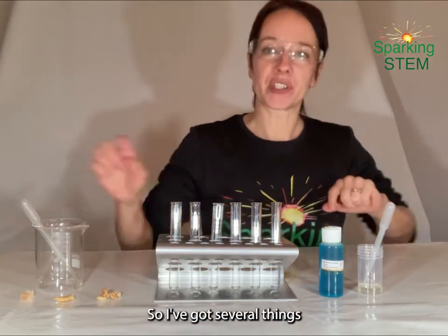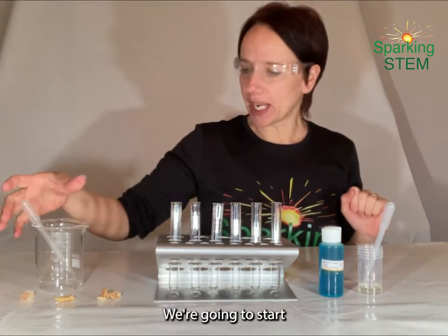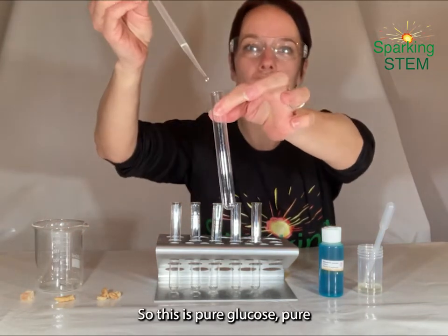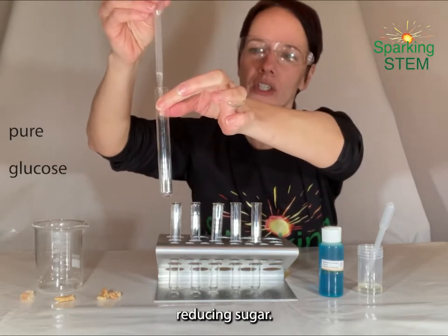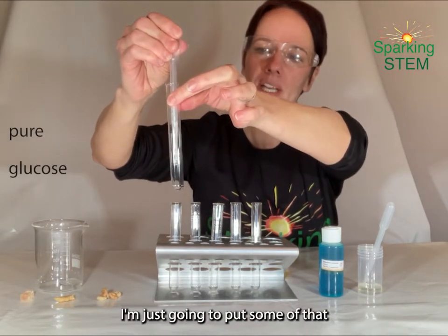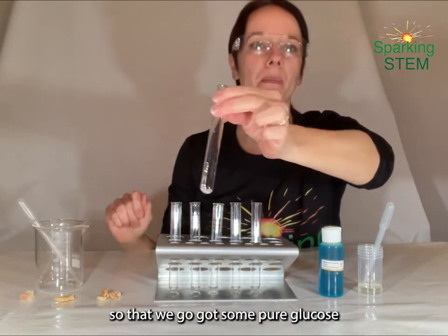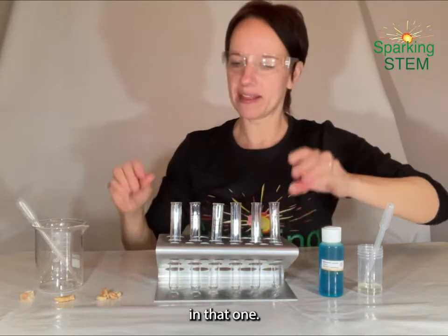So I've got several things I'm going to test here. We're going to start with a very simple glucose solution. This is pure glucose here, a pure reducing sugar. I'm just going to put some of that in the bottom of this test tube. There we go, I've got some pure glucose in that one.